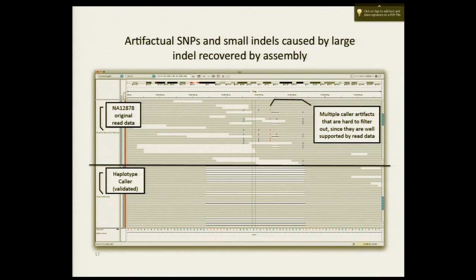Exactly. So one benefit of doing a whole genome assembly and using all the unmapped reads would be that you get these large insertions, right? Because you get the places where the reads don't have the correct approximate placement, right? Because right now we're assuming the approximate placement is correct. So places where it's not correct is where the whole genome assembly is beneficial.